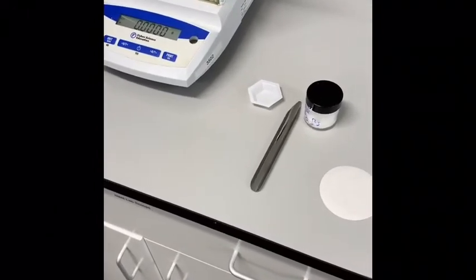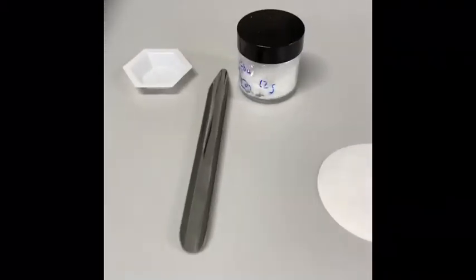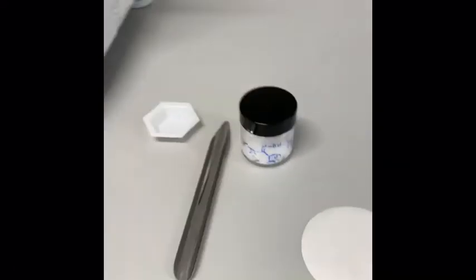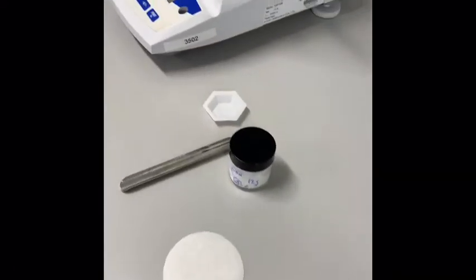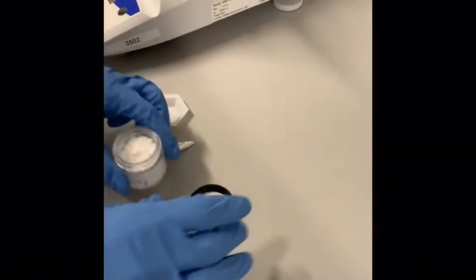Today we're starting with our Beckman rearrangement. We are about to weigh out our oxime here. We need about 0.2 grams, so we're going to go ahead and tare the balance with the weigh boat on it.